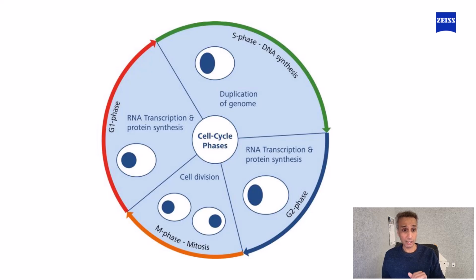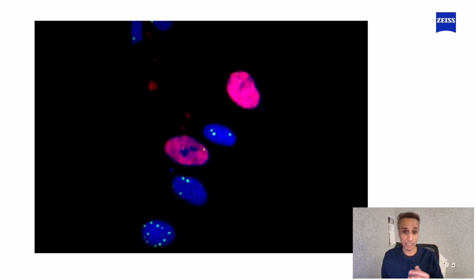Microscopy, of course, is quite often used for these types of studies, genotoxicity studies, because the primary outcomes of genotoxicity, like DNA double-strand breaks or micronuclei, can be easily detected via microscopy imaging. Also, various antibodies now are available to detect features of interest.